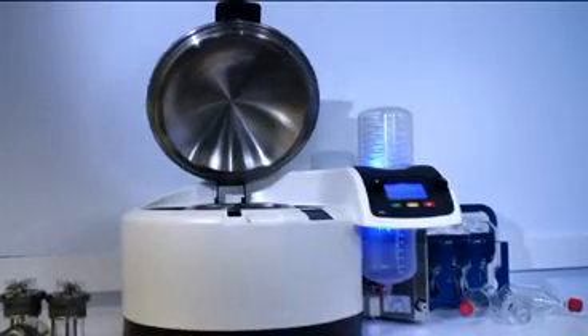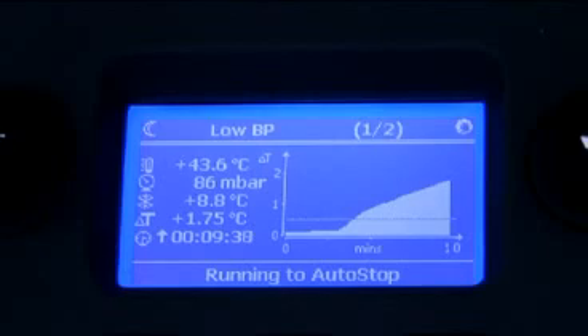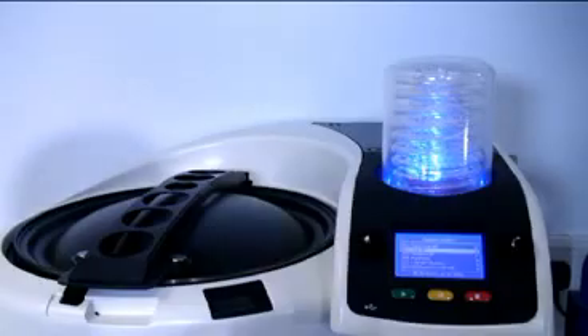The system will evaporate the samples automatically, leaving the operator free to do other things. Dry-Pure pressure and temperature are all accurately controlled by the system, stopping automatically when the samples are dry.